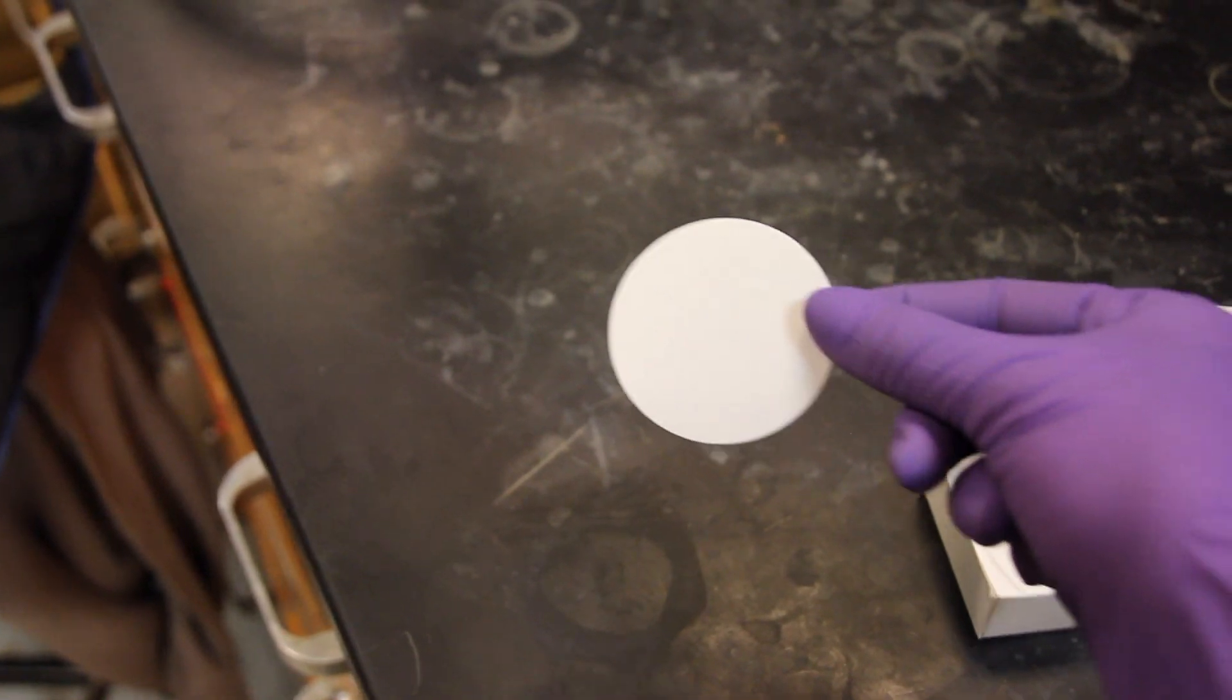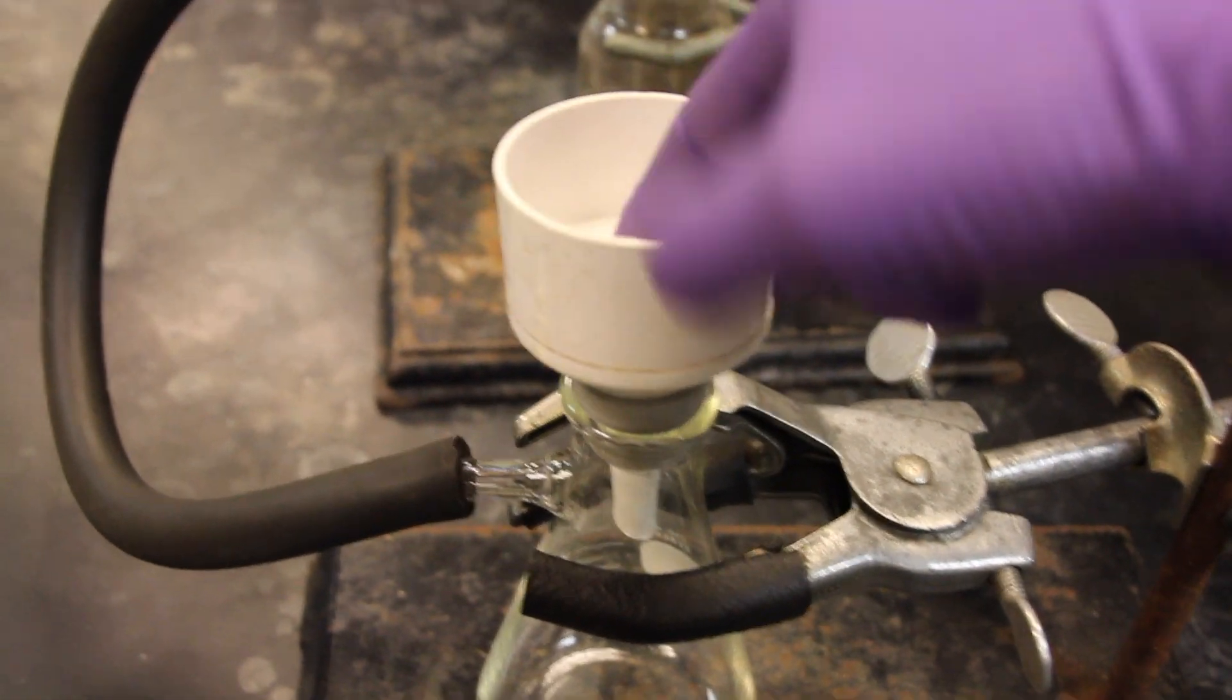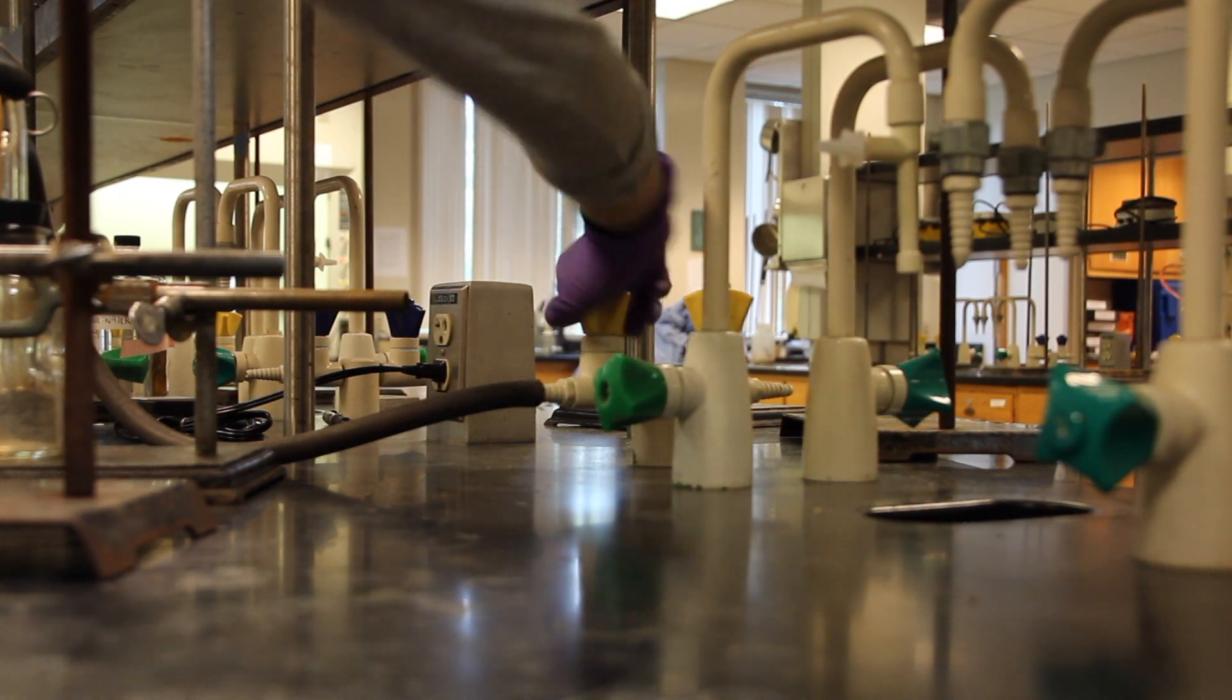Next, filter paper is placed into the Buechner funnel to catch the solid product. Once the vacuum is turned on, you are ready to recrystallize.